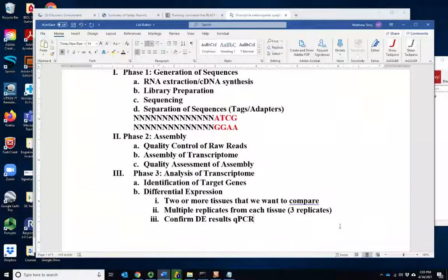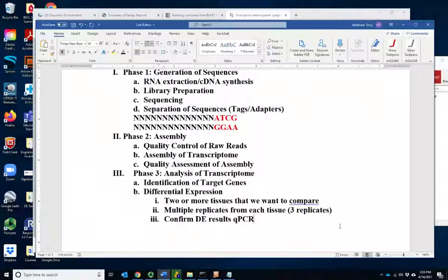That pretty much takes us all the way through transcriptome assembly and a bit of transcriptome analysis. You're going to see some additional questions that I've answered as we went through this. Make sure you go through and answer those questions in the lab, save your Word document, and turn that in as an attachment. Then go into the lab questions assignment — it will just sample some of the questions you've already answered — and cut and paste those answers in and turn that in. If you have anything you want to go over or are uncertain about, send me an email or log on during Zoom office hours and I'm happy to review the answers. Remember, those same questions in multiple choice form are going to be on your lab final.